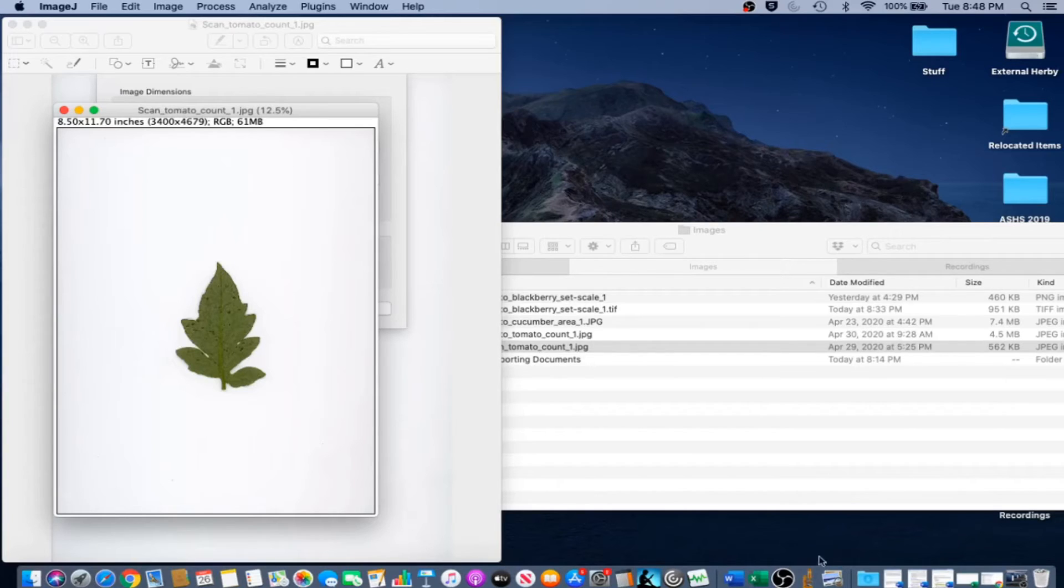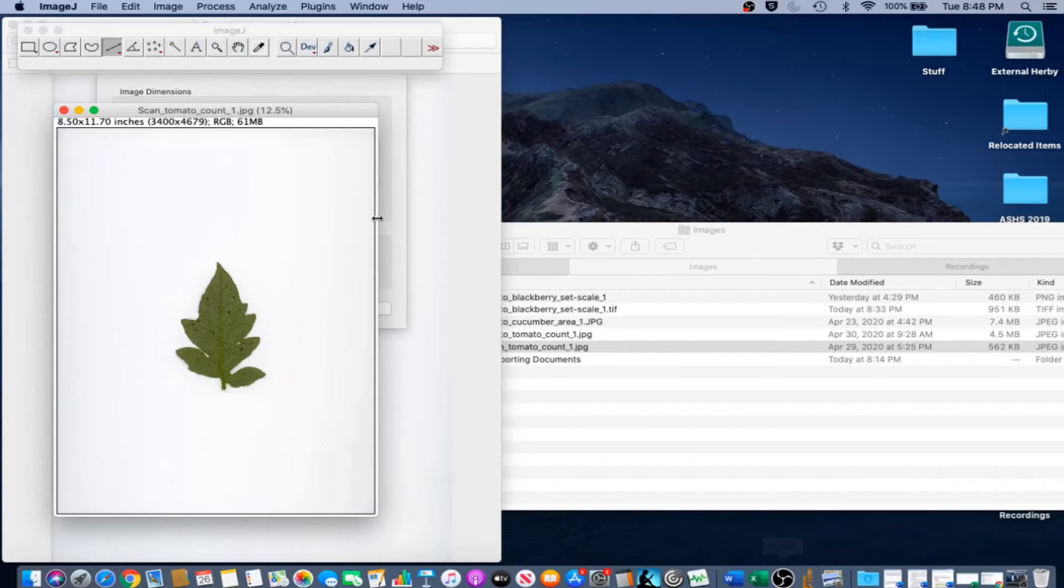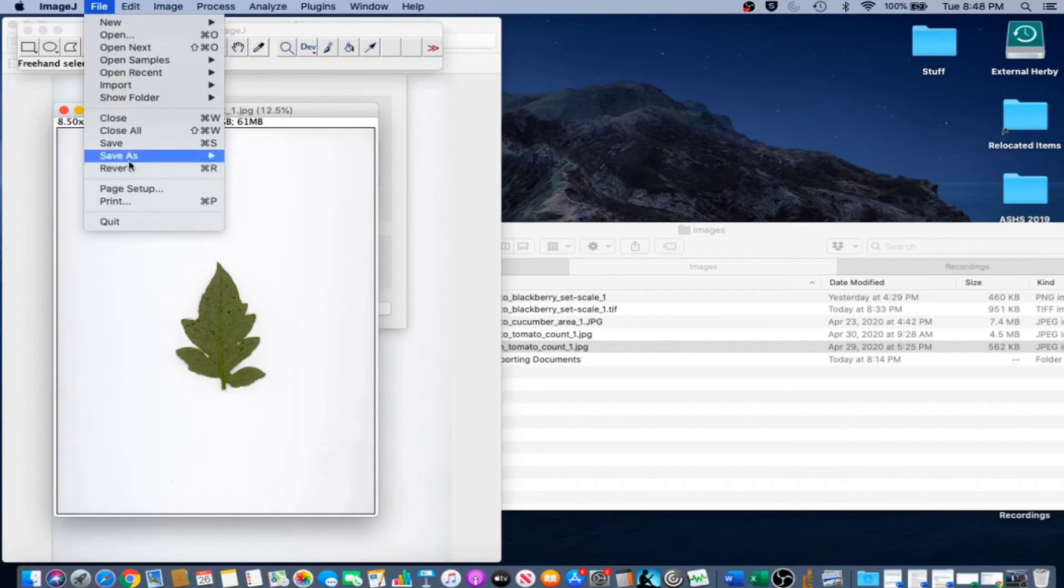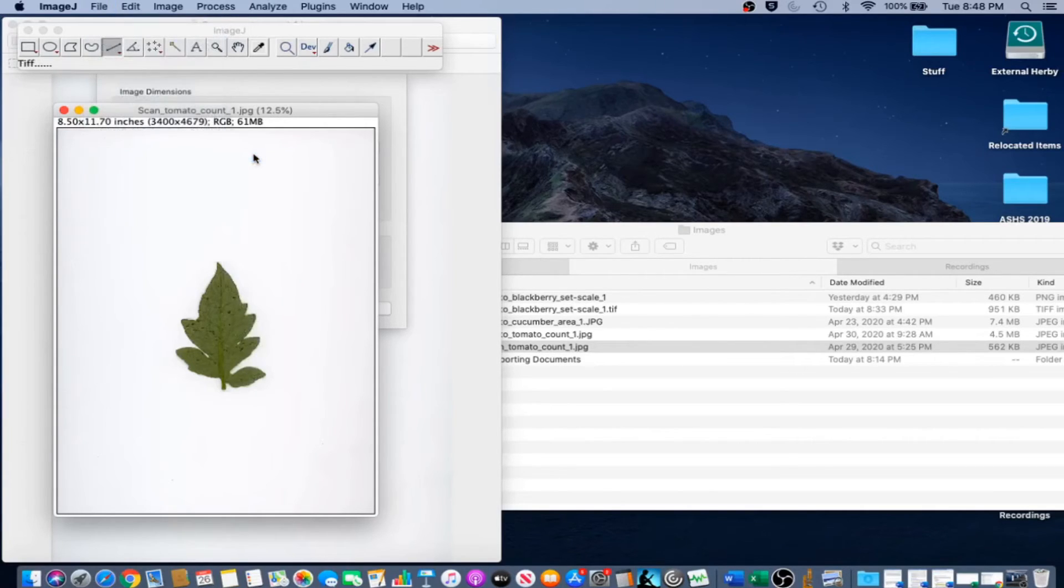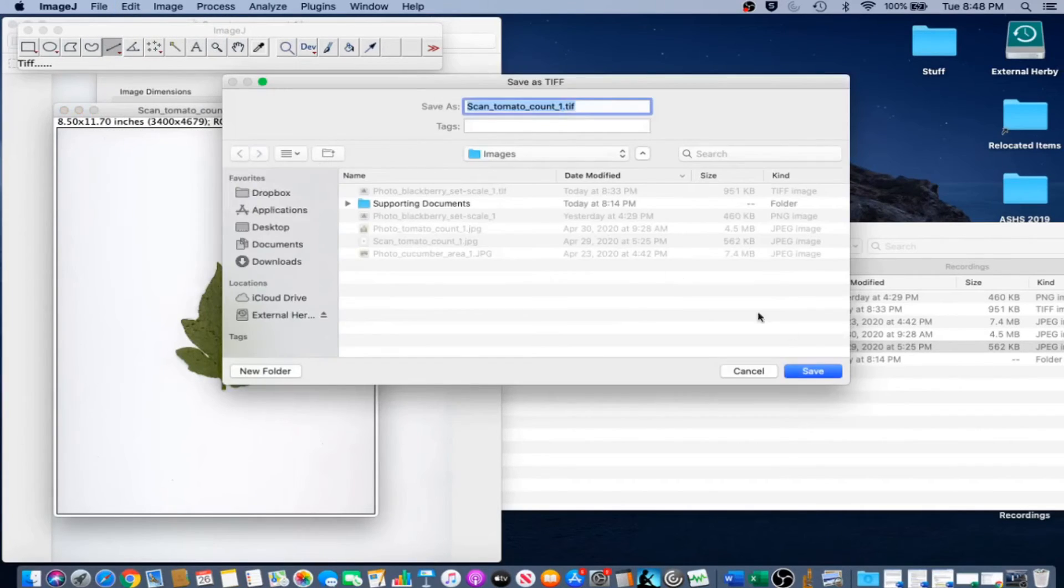And now our image is scaled, and we are going to save a copy of that scaled image. So we're going to go File, Save As, TIFF. Go ahead and save.